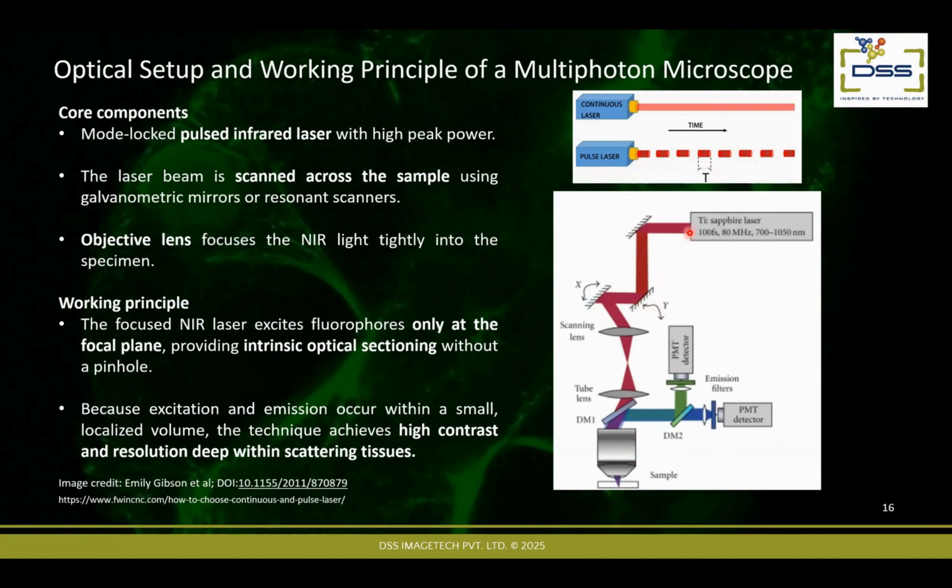In a normal confocal microscope, your excitation light will be focused onto the specimen using these mirrors, and then the emitted light will travel back through the same path to the detector. For deep tissue imaging, this is not very ideal because you're collecting photons from very deep inside the tissue. And often the rarer photons from deeper in the sections get diluted in this process, and then the collection is not very efficient.